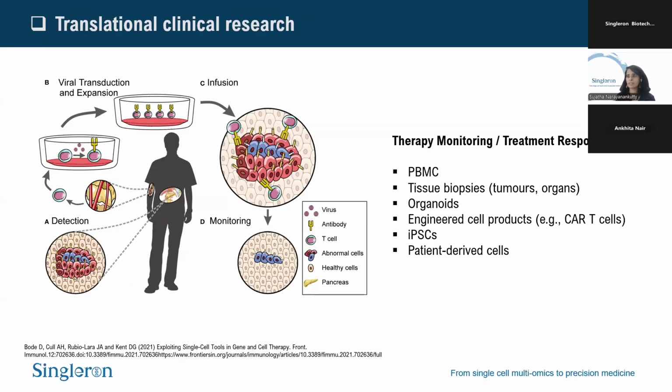If you think of the whole cycle of administering therapy, monitoring and treatment, you have to work with many different sample types like PBMCs, biopsies, organoids, engineered products. And in each stage, starting from detecting tumor and then coming up with a therapy, then infusing it back, monitoring and carrying on, all of these steps require single cell sequencing to understand.